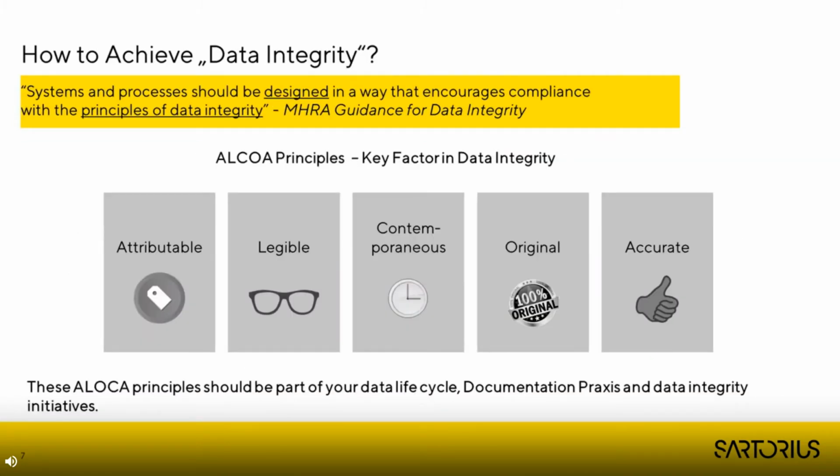So, how can we prevent this? First of all, organizations should follow good documentation practice to assure the completeness, consistency, and reliability of the records, and therefore follow the ALCOA principles. What are these ALCOA principles? First of all, the A is for attributable.